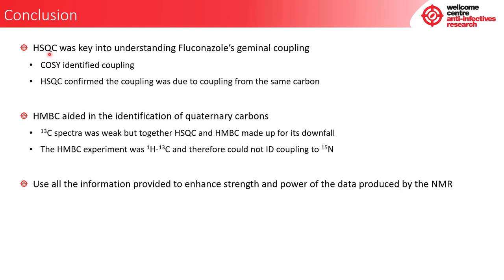The HSQC was key to being able to understand that fluconazole had perhaps geminal coupling, and that the COSY identified this coupling. The HMBC was a very, very powerful experiment. Why? Because it was able to identify the quaternary carbons, and not only that, but make the distinction between which of those aromatic proton 1, 2, or 3 and 4 was where it was on that triazole ring.